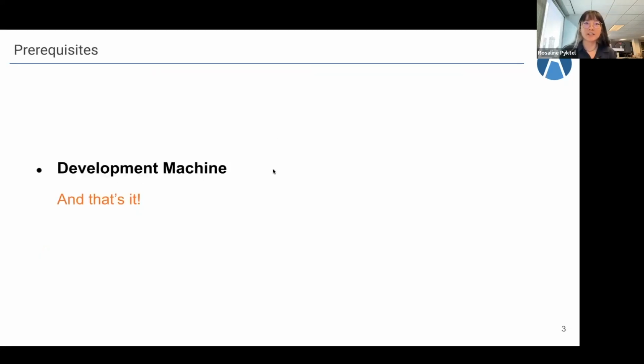So, prerequisites. To exercise for yourself the topics and concepts in this presentation, it'd be beneficial to already have a LabKey development machine. This will provide the groundwork of familiarity with LabKey Server that we will assume here. But if you're not a developer yourself, this presentation will still be helpful in that it will cover from the functional perspective the capabilities of file-based modules. We will be showing HTML, XML, and JavaScript code during the demo section though, just so you're forewarned. But that's it. We'll cover modules from the ground up. So moving along.